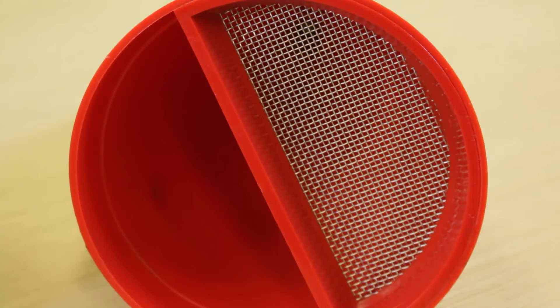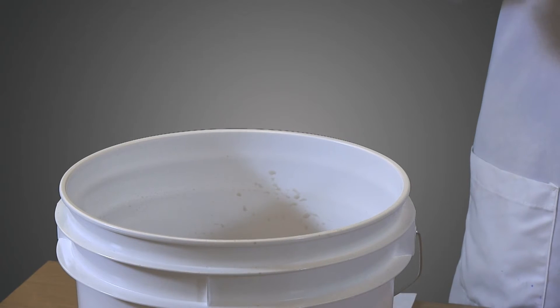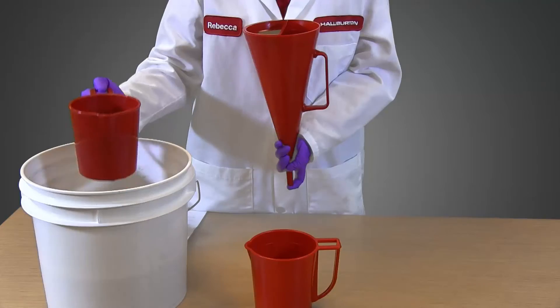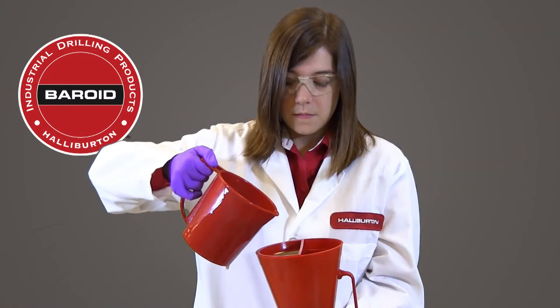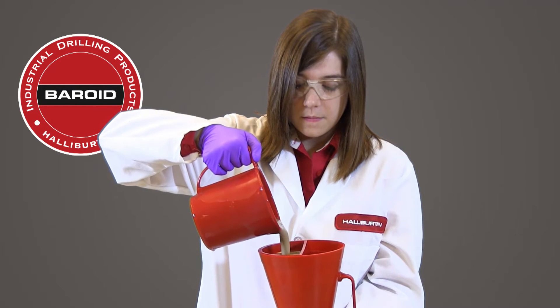When we test the fluid, we will first fill the funnel to the line just below the screen. We will then measure the rate or length of time it takes for the drilling fluid to flow out of the funnel to the one quart line near the top of the measuring cup. The cup is graduated and the one quart line is marked. Here we have a drilling mud that we want to test. We can use the measuring cup to collect a sample and fill the funnel by pouring the mud through the screen to the line near the top of the funnel.